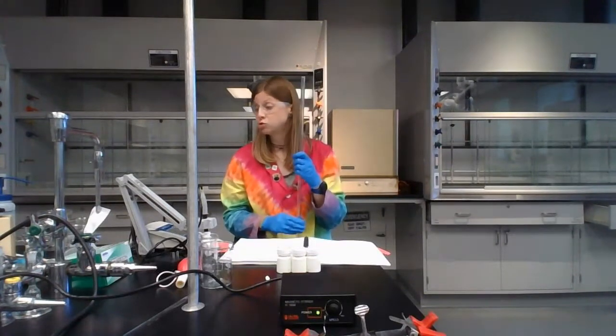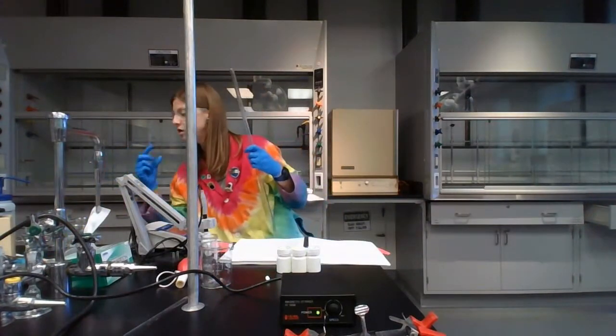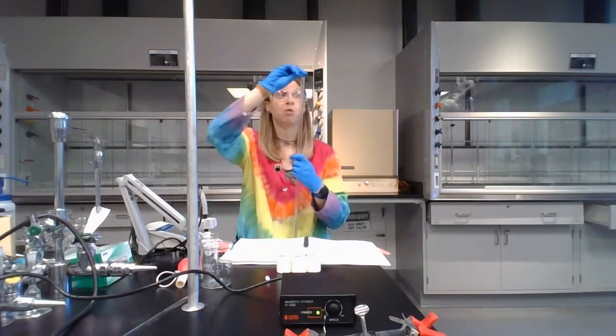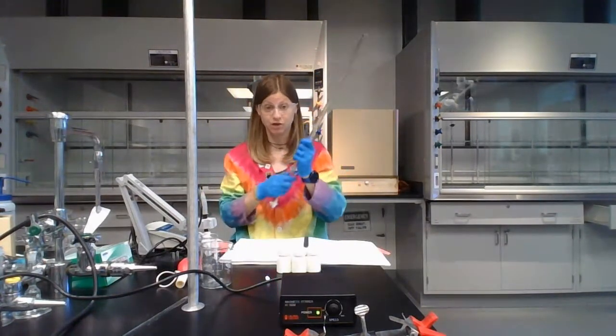You can use a disposable pipette to get the sodium hydroxide right at that 0.00 mark. Or you can just pour it in and then use the stopcock to let the liquid out until the meniscus stops right there.